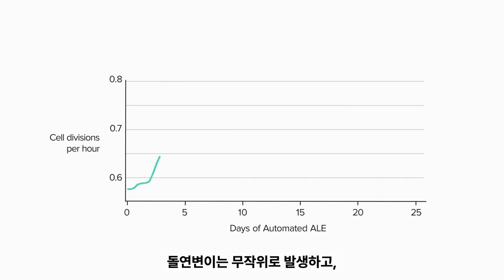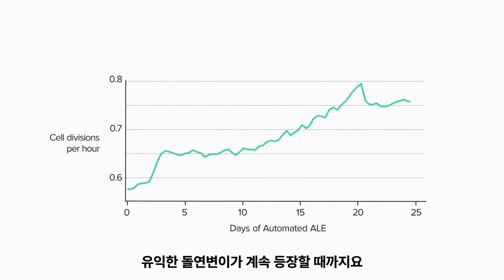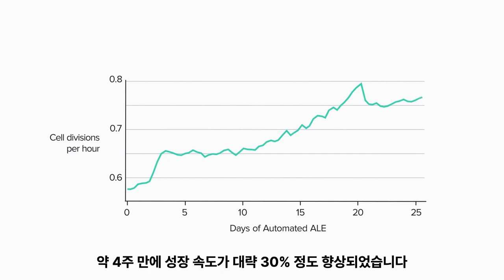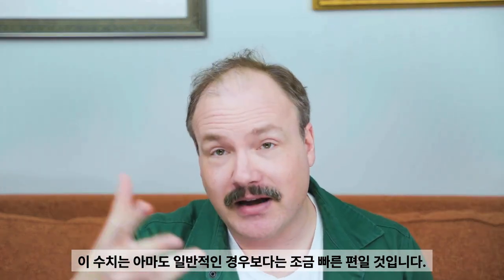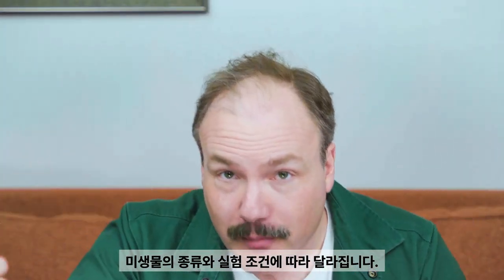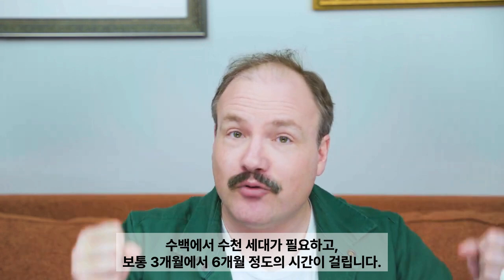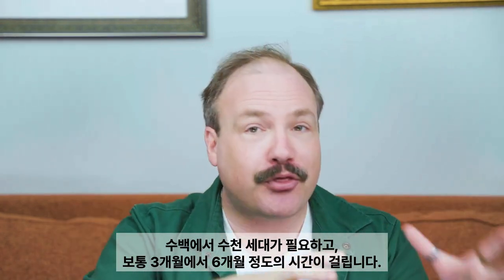Mutations are happening at random. They accumulate over time. The natural drama of survival of the fittest plays out again and again for as long as beneficial mutations continue to arise. In this particular run, we saw the growth rate increase by about 30% in about 4 weeks. Those numbers are probably a little faster than is typical. Of course, how much improvement we see and how quickly depends on the microbe and the conditions. But as a rule of thumb, evolving a microbial population takes hundreds or thousands of generations and 3 to 6 months.